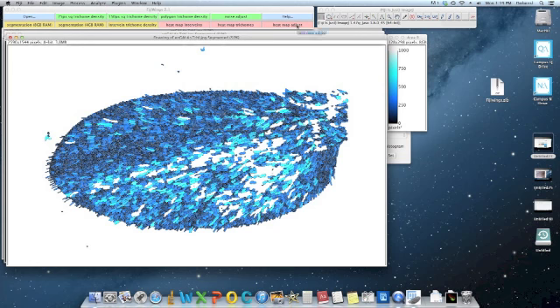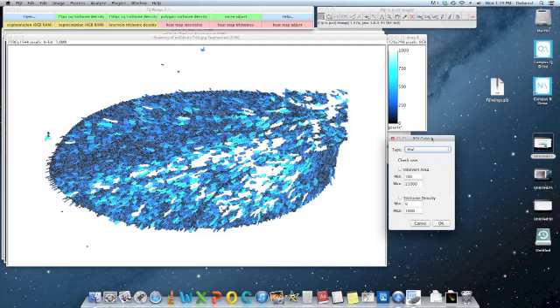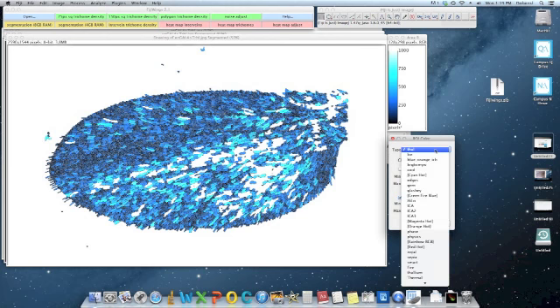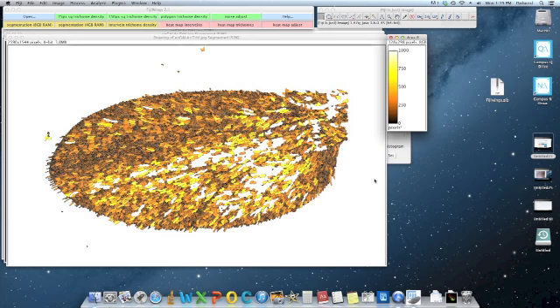You can use this button, Heat Map Adjust, for this pop-up box and choose trichome density as opposed to intervein area, and then play with colors and play with ranges. So I can change this to orange. Hit OK, and it will change accordingly.